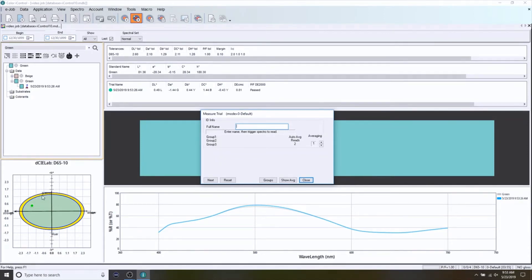I could make determinations on what I need to do if my color were to fail from that point. So those are the basics of standard creation and measuring trials. We will be doing additional videos to help you dive deeper into the evaluation of the results and the things that you do based on those results. Thank you.